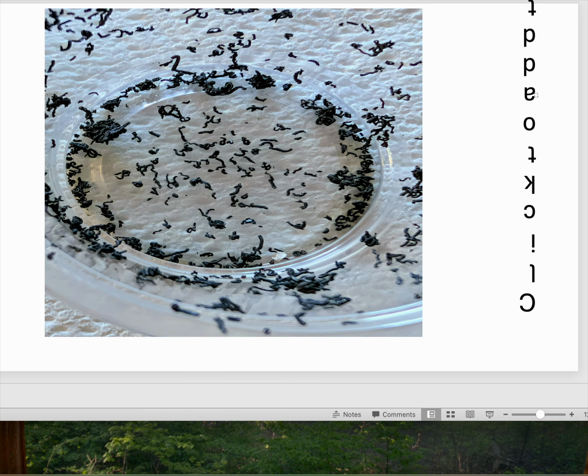Here's a picture of the expanded graphite, which to us at our school was a gift from Asbury Carbons in western New Jersey, USA. We thank them very much for their generosity.